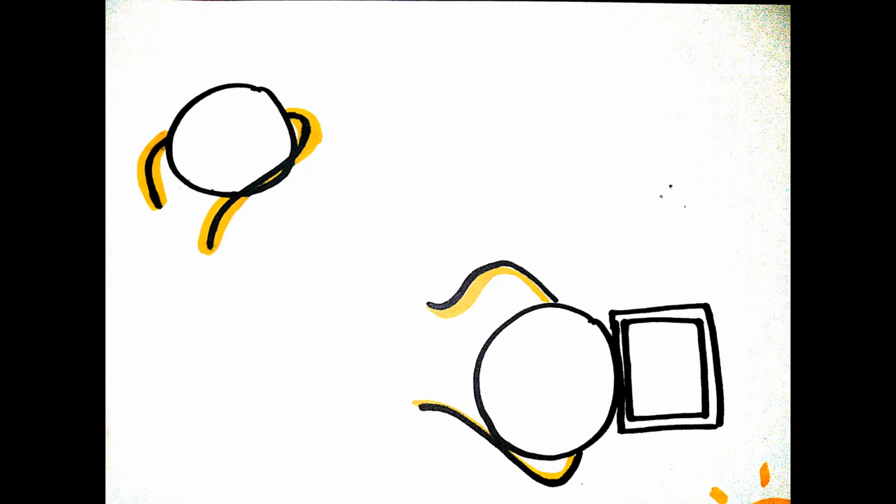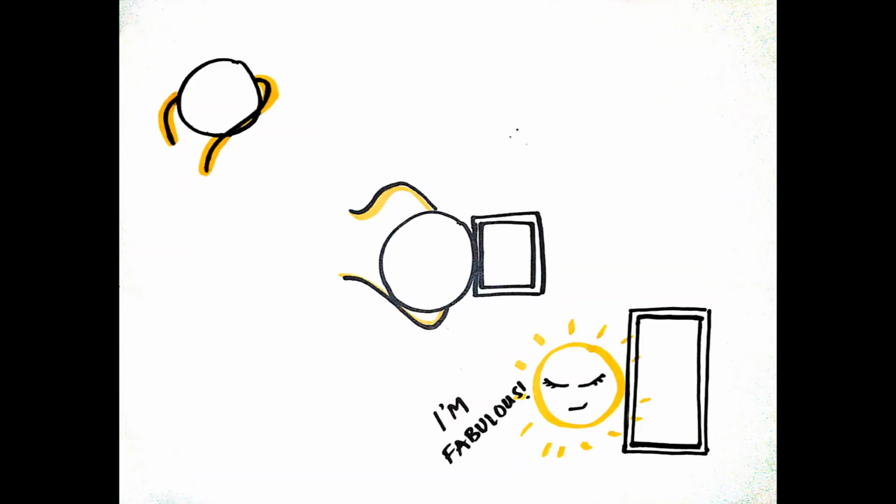In MST, one binding partner is fluorescently labeled. That means we simply introduce a dye. These fluorescent materials are covalently attached to the molecule of interest. We must make sure that the dye does not interfere with the original binding site. Therefore, the proteins are labeled far from the binding site, minimizing the disturbance to the interaction between the biomolecules that we are testing. When molecules have intrinsic fluorescence, we can run label-free experiments.